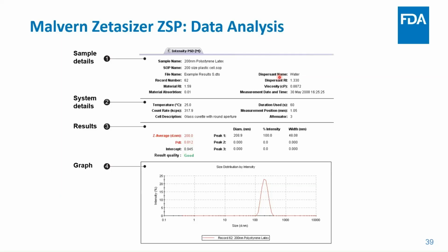These are two things to always check first to make sure these are within reasonable values. Then, of course, making sure they report a temperature. What temperature is it?